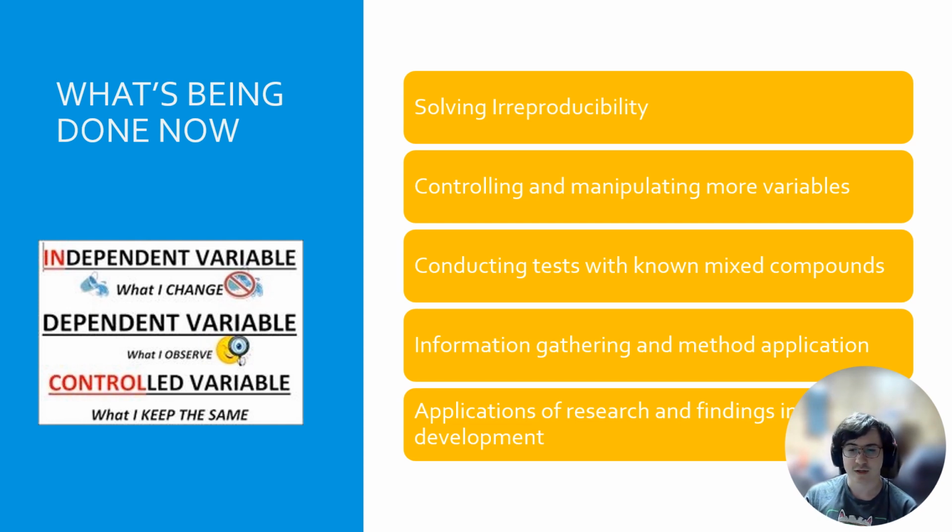And I worked on controlling and manipulating more variables. So I worked on controlling when the injection happens of my internal standard or of the compound of interest, controlling temperature a little bit harder, controlling salt concentration, sonication times, and all of that stuff has major impacts on the end result.